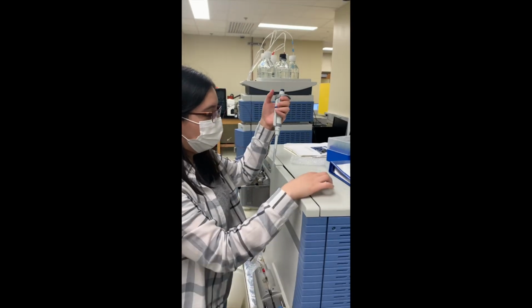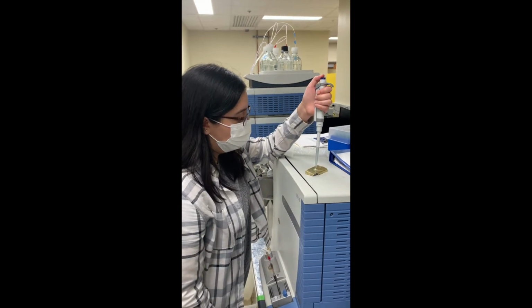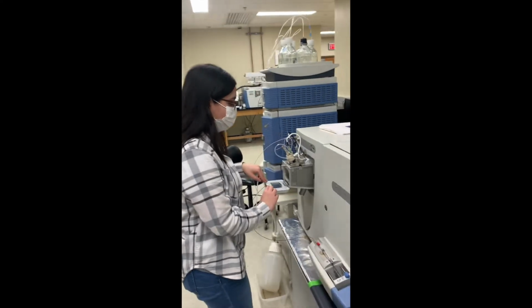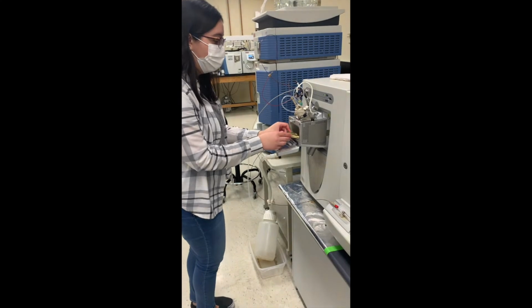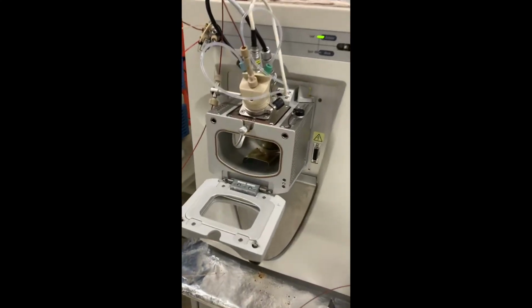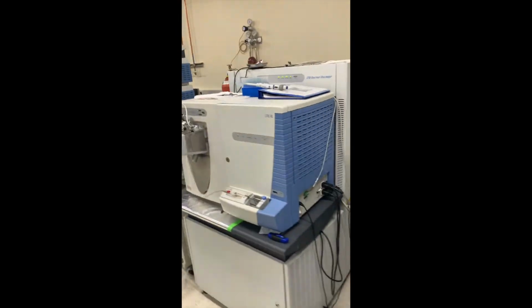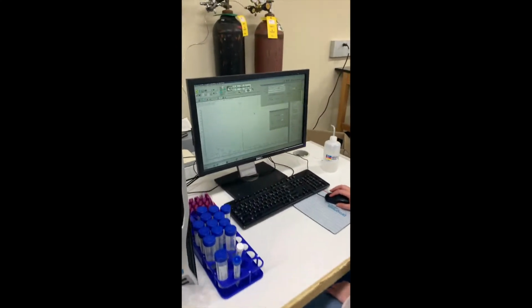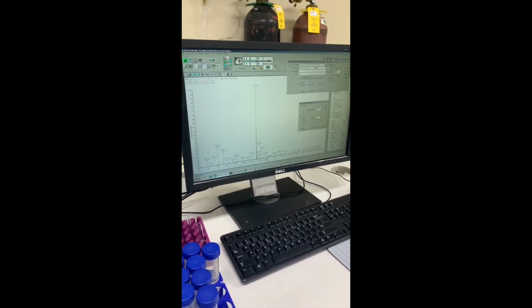My project consists of performing nano electrospray ionization hydrogen deuterium exchange mass spectrometry, or NESI-HDX MS, experiments with the Orbitrap Discovery mass spectrometer to characterize and distinguish various carbohydrates. By placing a droplet of D2O on this plate that sits inside the source, a deuterated environment is created, allowing for the carbohydrate to be labeled, and the changes in mass can be detected as shown by the spectra.